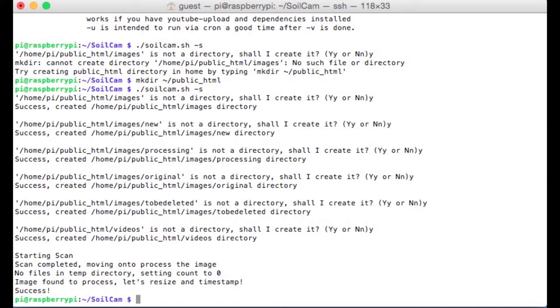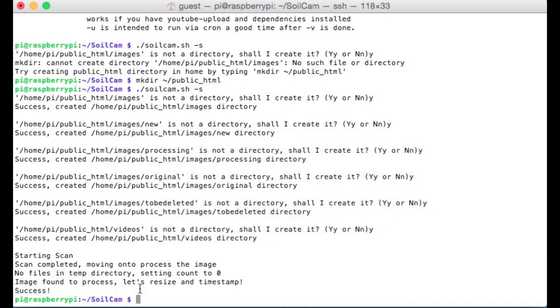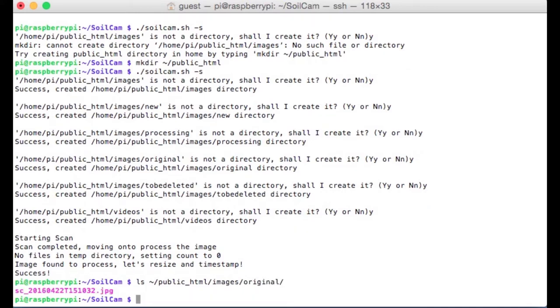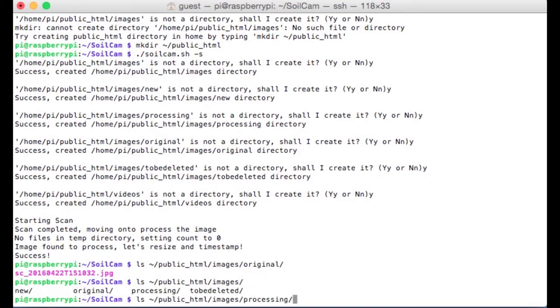If we actually want to check to see if this file is there, we can do a couple things. We can type ls tilde slash public html images, and we can either check the originals directory, and there's a file there. What other directory can we check? The processing directory. So the original directory gives us the original unmodified JPEG. That's a bit of a lie, because the scanner originally scans in something called a PNM or a TIFF file format. So we're already modifying it once, but the full resolution image goes into the original directory. A reduced file size image goes into the temp directory, and that also contains the timestamp.